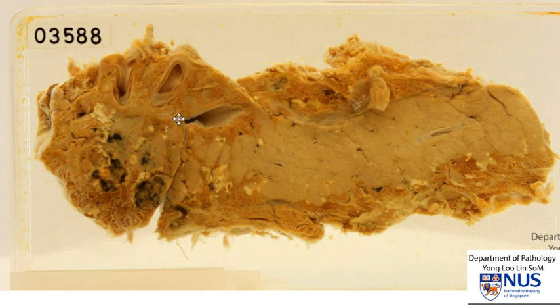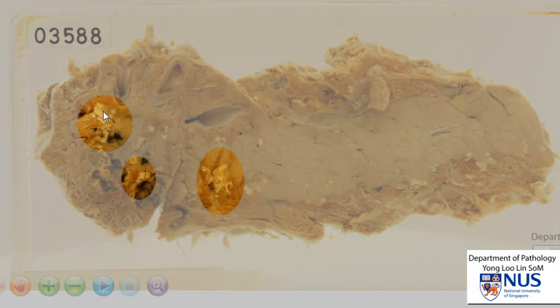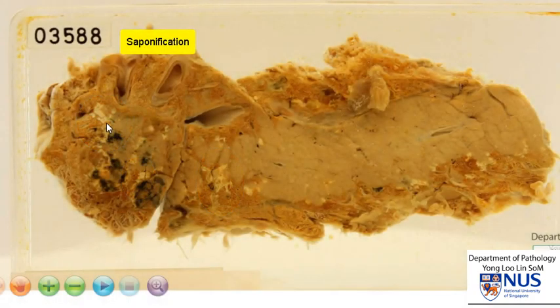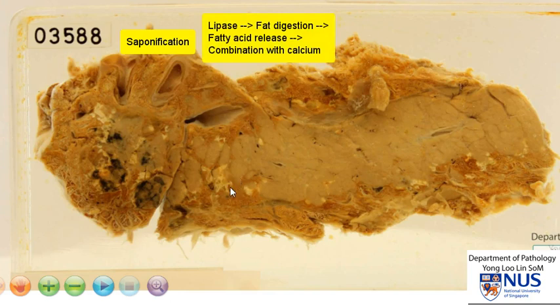This pancreas shows some areas of abnormality. In these regions you can see some kind of pale yellowish or whitish chalky deposits. These are likely to represent soaps from the process of saponification. This is a result of lipase digestion of the fatty tissue, either in the peripancreatic fat or in the adipose tissue within the pancreatic parenchyma. There is a release of lipases from the acinar cells and digestion of fat, with fatty acid release combining with calcium and therefore formation of soaps. We can recognize this grossly.